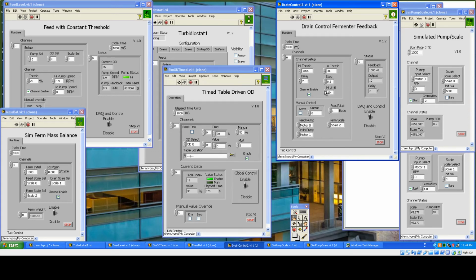alignment. But let's just pop this up to 11, pushing the up arrow, and this allows our output to adjust upward. And what we'll see is this is now coming down. Now, of course, the algorithm here is very simple, so as long as it's above the high threshold, it's going to speed things up. At this point, actually, we're rolling back toward 1005, and as soon as we cross the threshold of 1005, it's going to return to just matching the feed input.